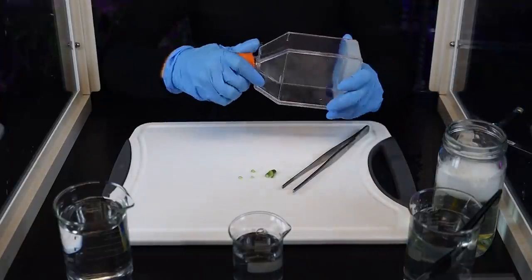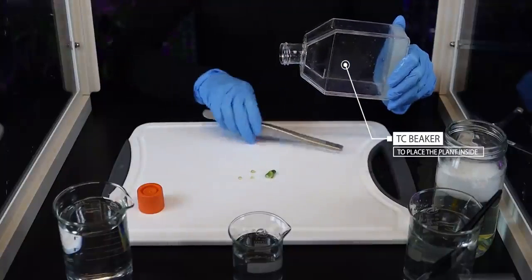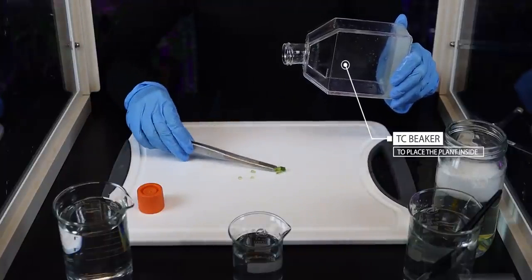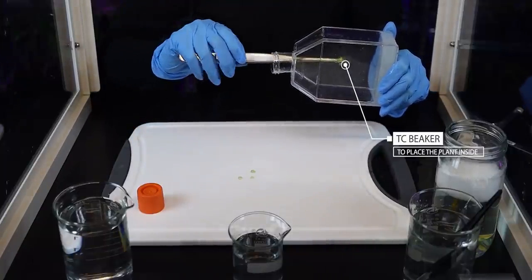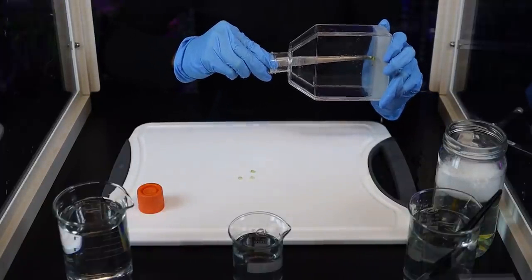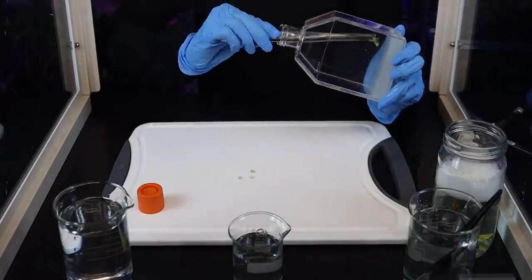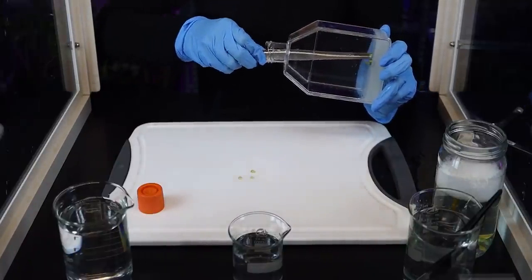I'm opening my growing container on its side to further reduce any chance of contamination and I'm placing the plant material into the agar. Now, honestly, this can be a little bit tricky, especially for me in this demo as my tweezers just aren't quite long enough to use on these containers. So, as you can see, it's a little bit fiddly, but I do get it in the end.